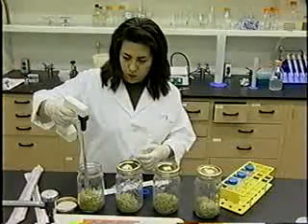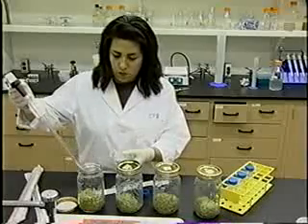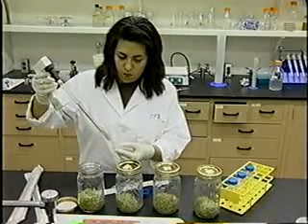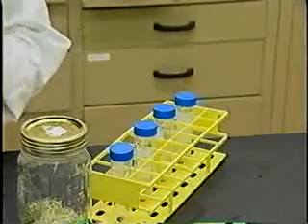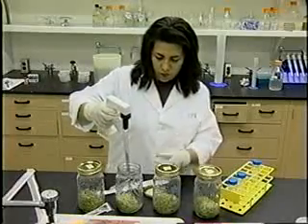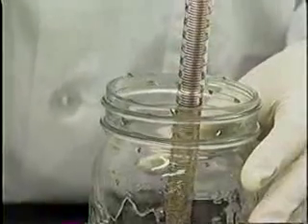The tests for pathogenic microorganisms as described previously may be conducted to screen incoming seeds. Other microbiological tests on seeds may be conducted as microbial indicators of quality. This activity is very often performed by the seed supplier or distributor, and not necessarily by the sprout grower, unless the grower wishes to include it as a further verification activity. Such testing may be written as a specification in the contract to purchase seeds.